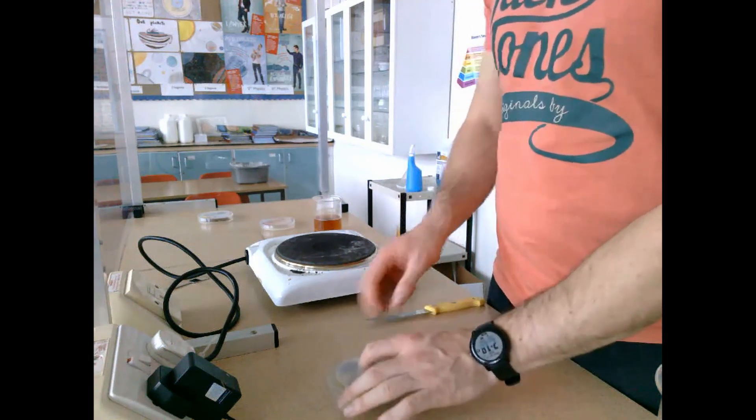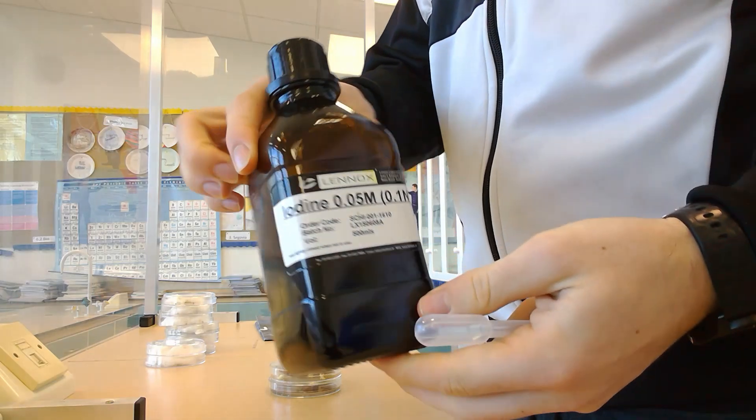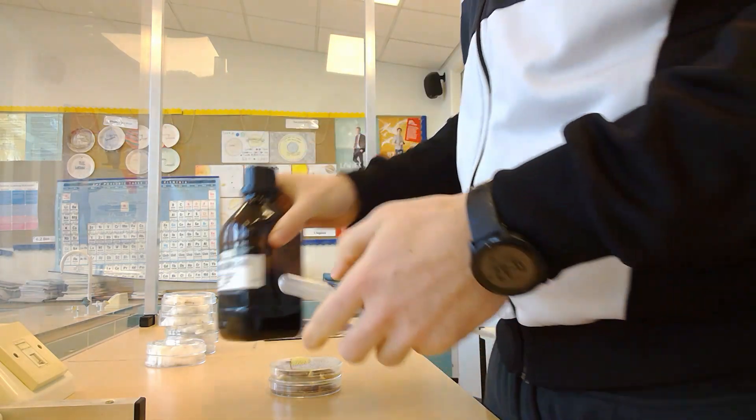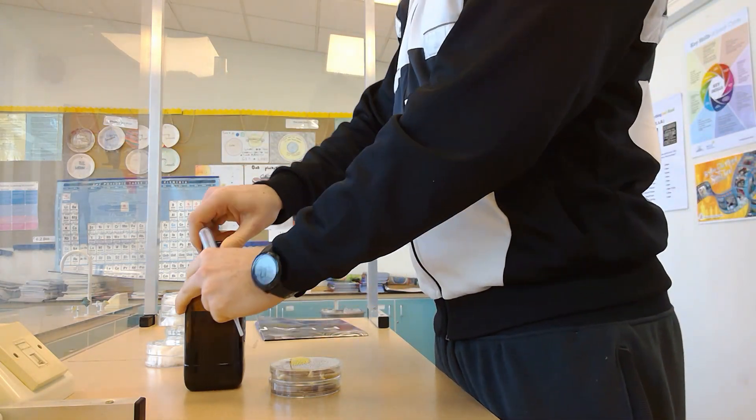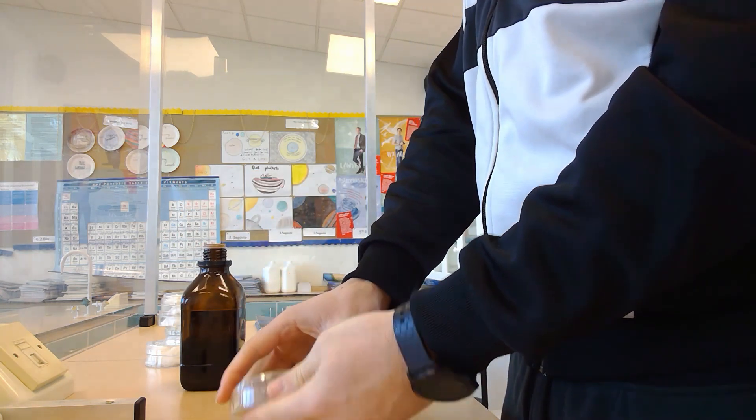These were incubated for 48 hours at 25 degrees before testing with iodine. Iodine tests for the presence of starch—if starch is present, it will turn blue-black; if not, the color remains the same.